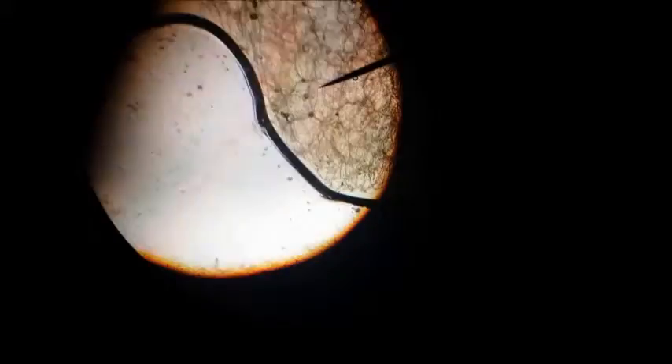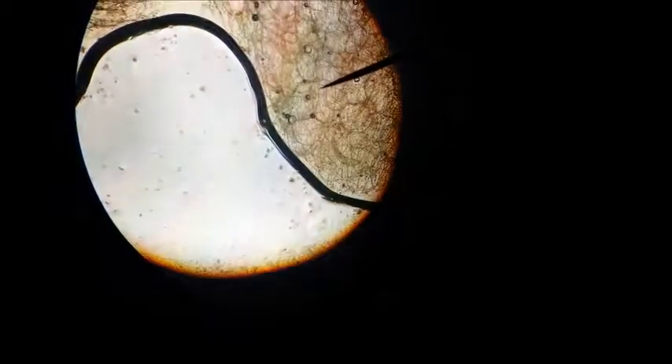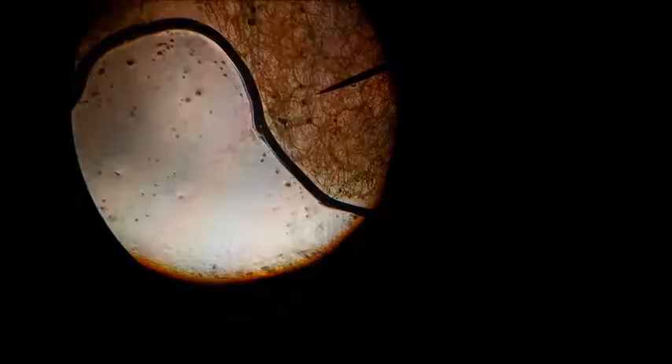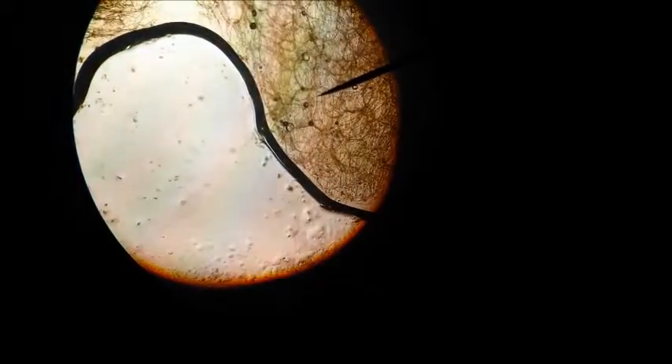This is 40x magnification. You can see a nice nucleus, and you can see multiple layers of cells here. That's good — it's a stable picture right there.